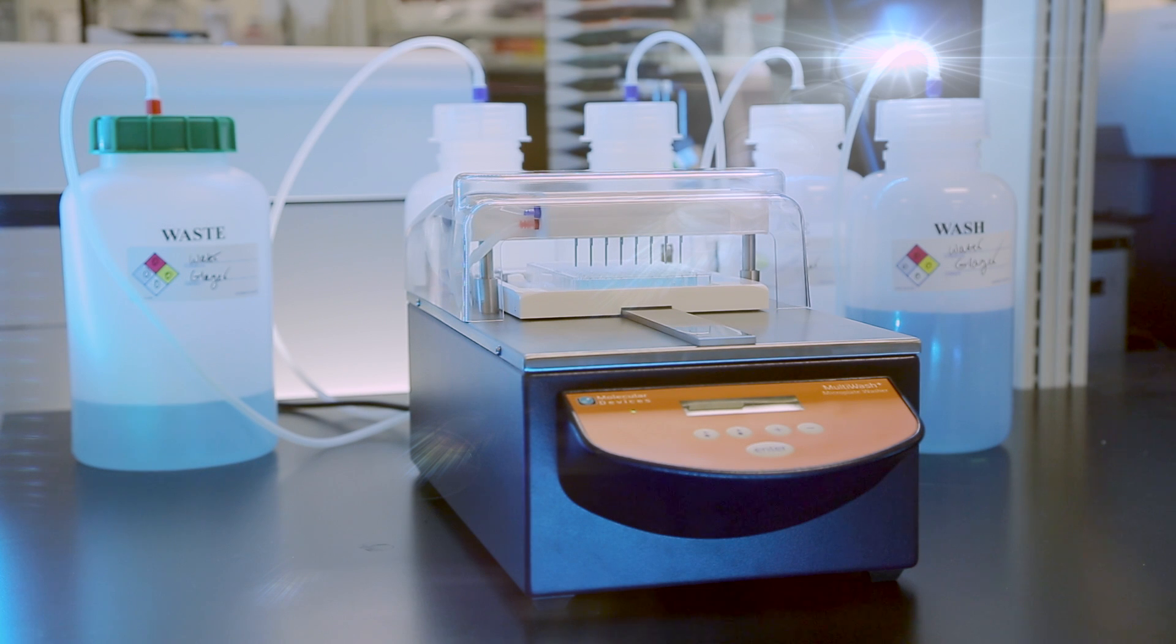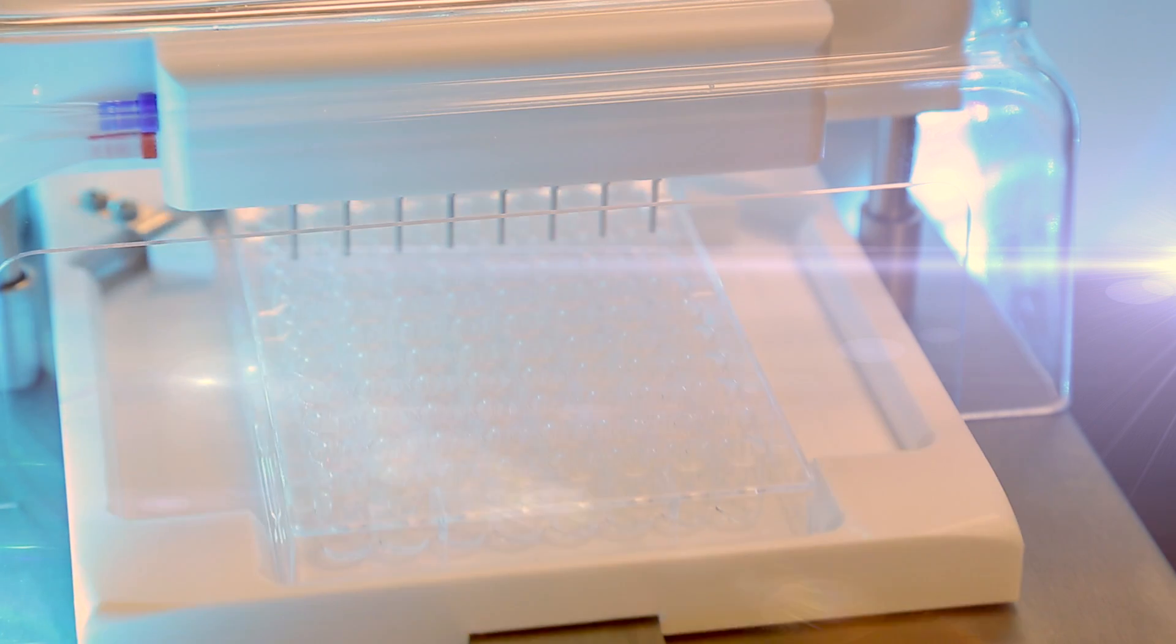If you develop the assay in a 96-well format but want to upgrade to a higher density plate, the washer can be fit with an optional 16-pin manifold. 50 protocols can be stored with up to 20 cycles for each protocol.